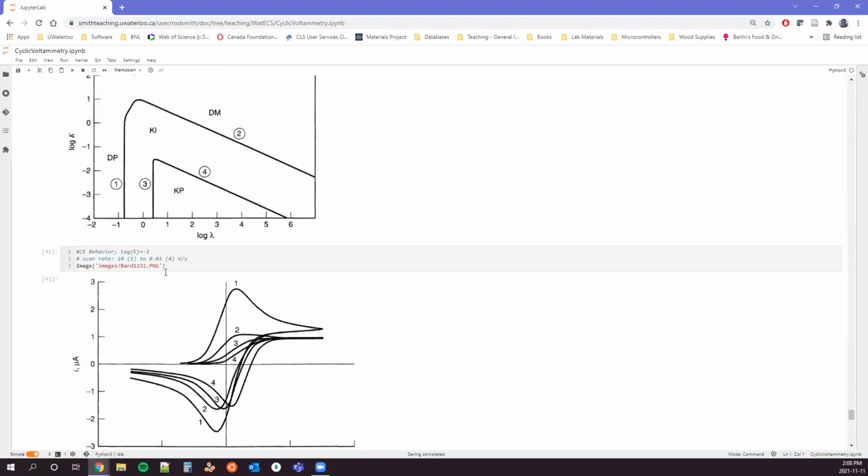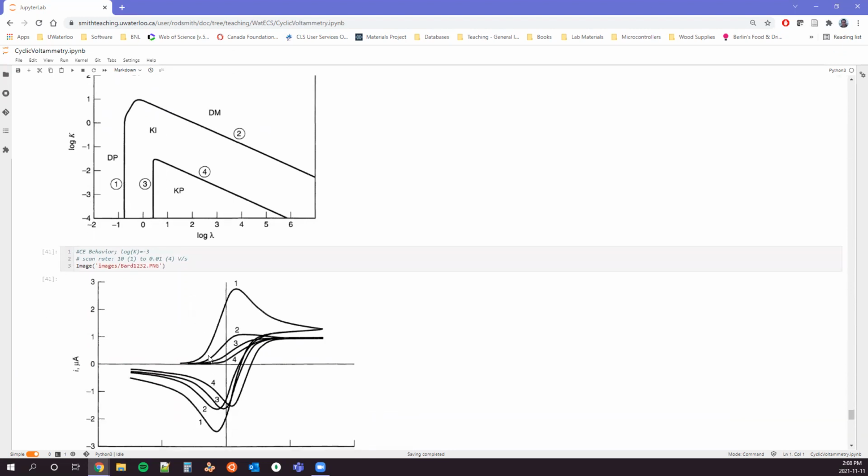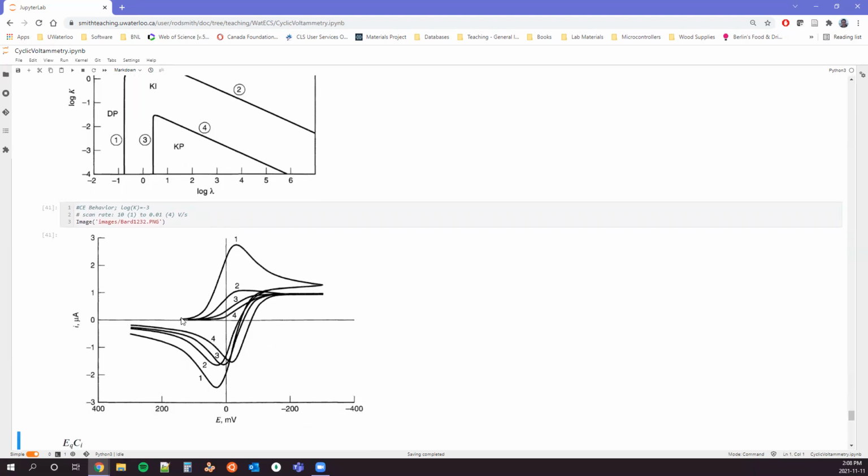And so here's an example where it's scanning at log of K of -3. It's scanning across here, and we're cutting through each of these different zones. You can see at point one, it's over here in the diffusion limited zone. You get a nice strong oxidation peak, or sorry, I think it's reversed. You get a nice strong reduction peak and then a nice strong oxidation peak that's paired to it, purely reversible behavior. As you decrease your scan rate, the chemical reaction starts to factor in more. We're moving right across the zone diagram. You start to distort the behavior, right?